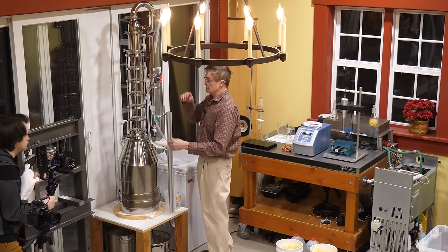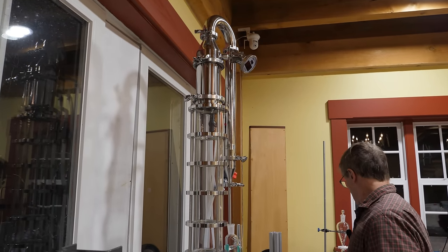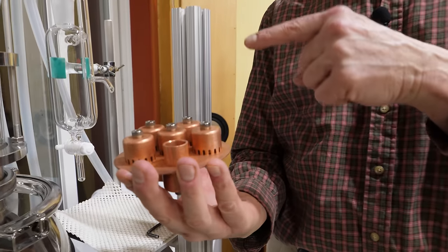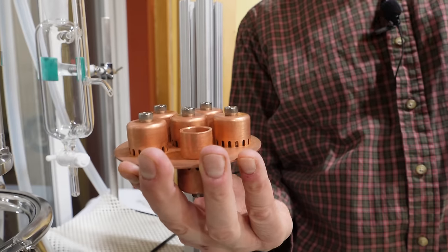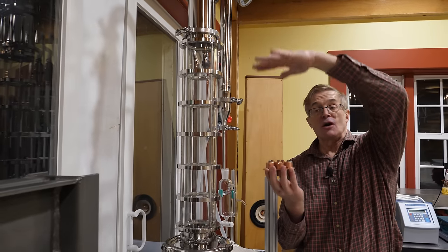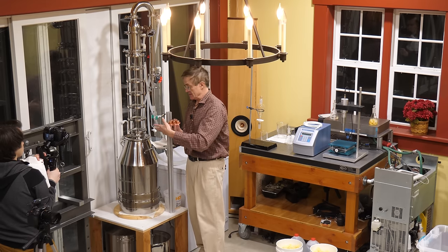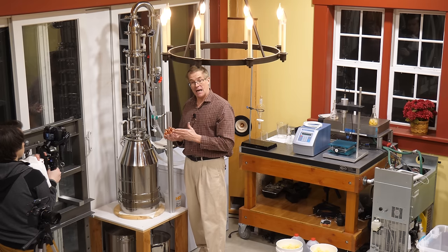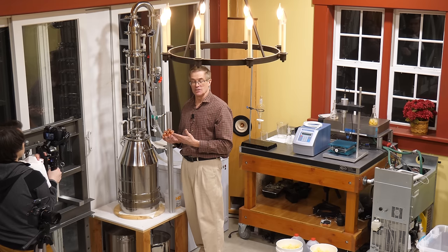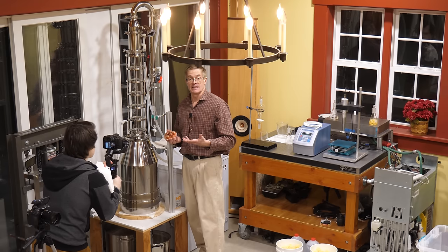If you look toward the top, this is the reflux tower — the device that normally would contain these copper bubble plates. In a reflux operation, these plates create more condensation and vaporization loops going up through the column to help separate alcohol and water vapor. In this case we don't need that because we're just going to be using this as a pot still, just as an evaporator. The copper is used because fermentations can generate a little hydrogen sulfide, but we don't have to worry about that here, so I've simply left these plates out — one less thing to clean.